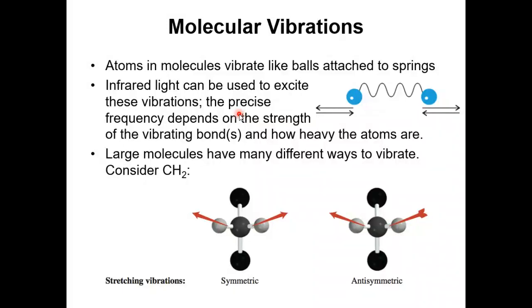Okay, so if we look at a molecule, the stretching vibration basically refers to those vibrations that change bond length without changing bond angle. Here we can see the CH2. The black one is a carbon, and those are two hydrogens.